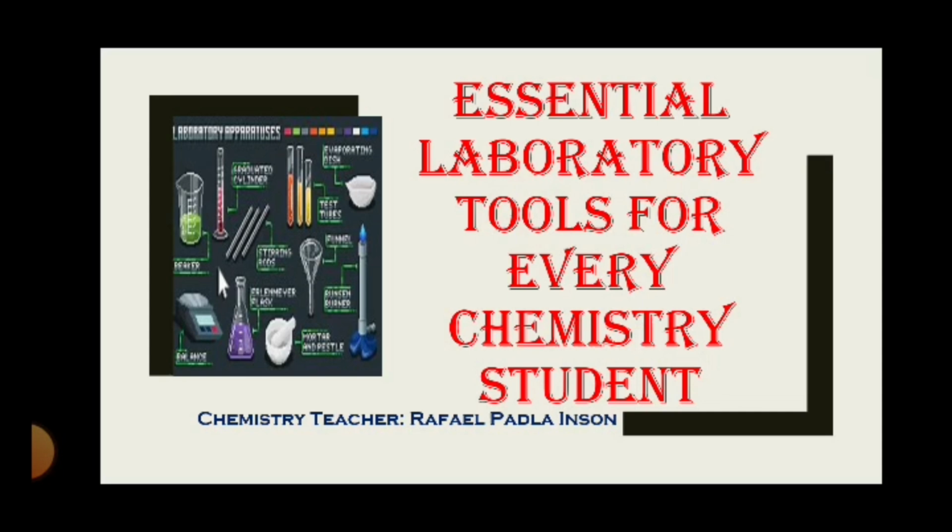Students who are watching will accurately identify and explain the functions of essential laboratory tools in chemistry experiments, demonstrating a comprehensive understanding of their purpose and utility in a laboratory setting.